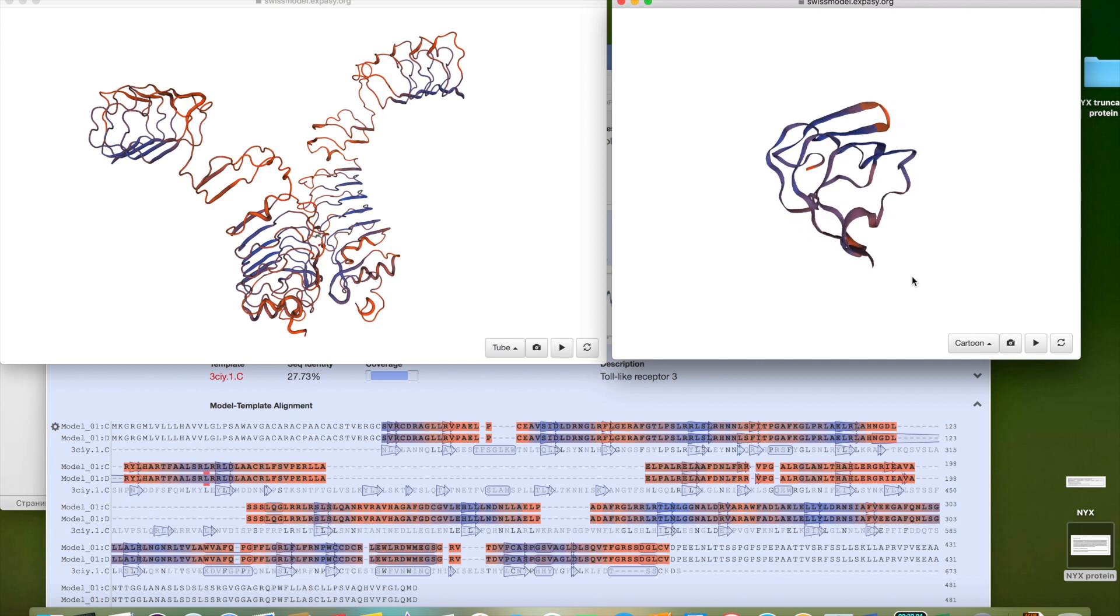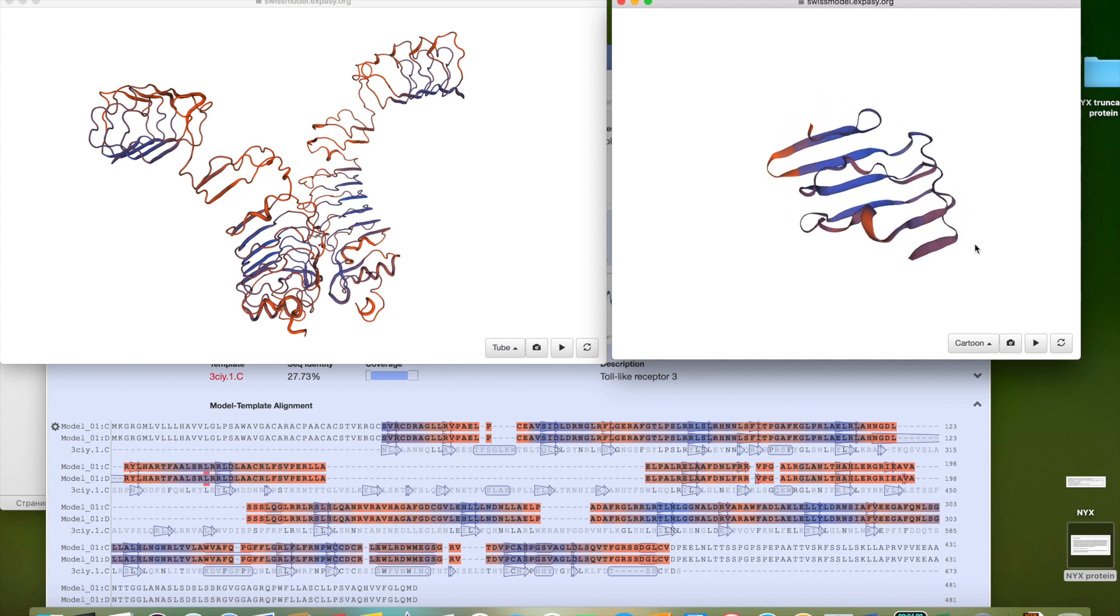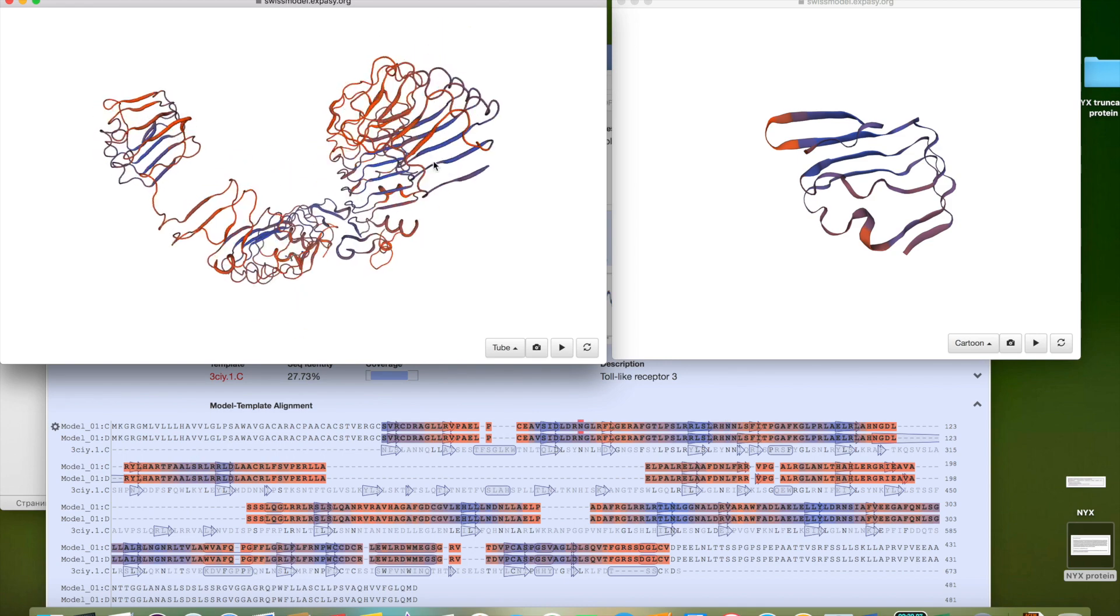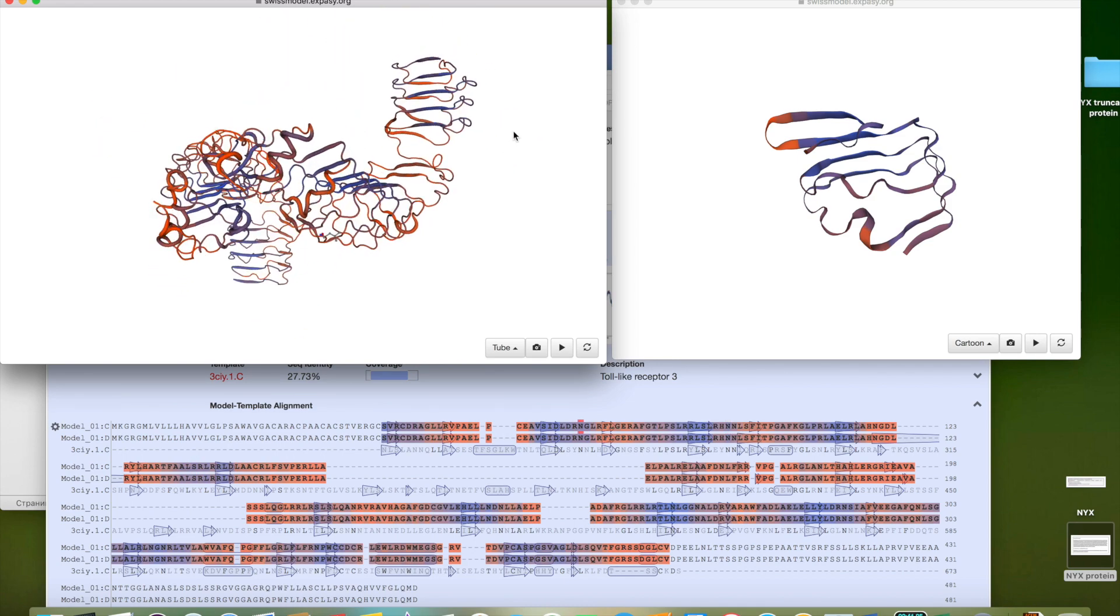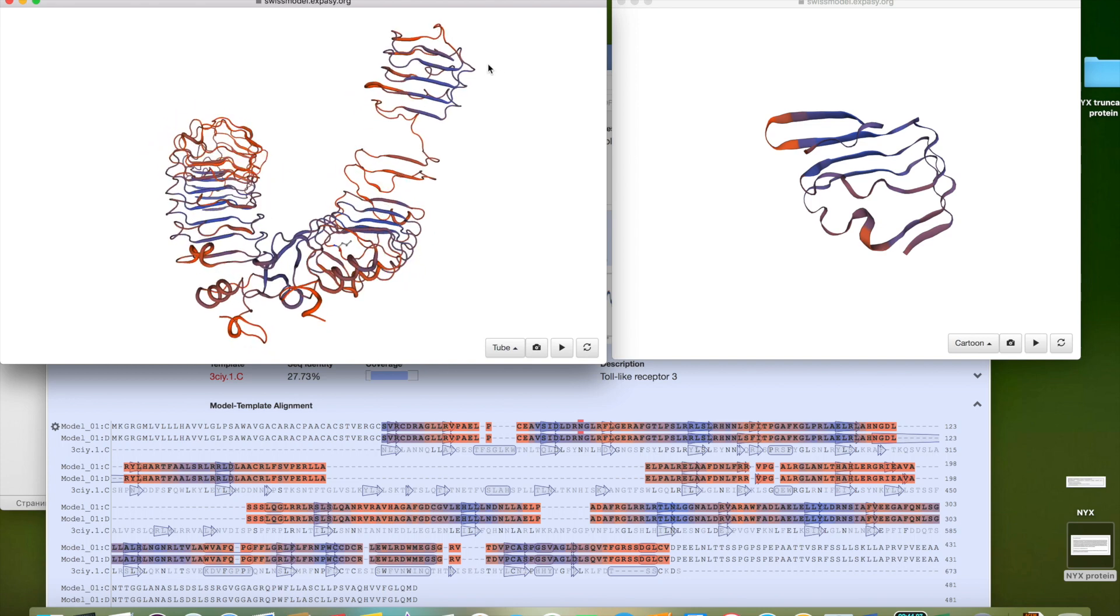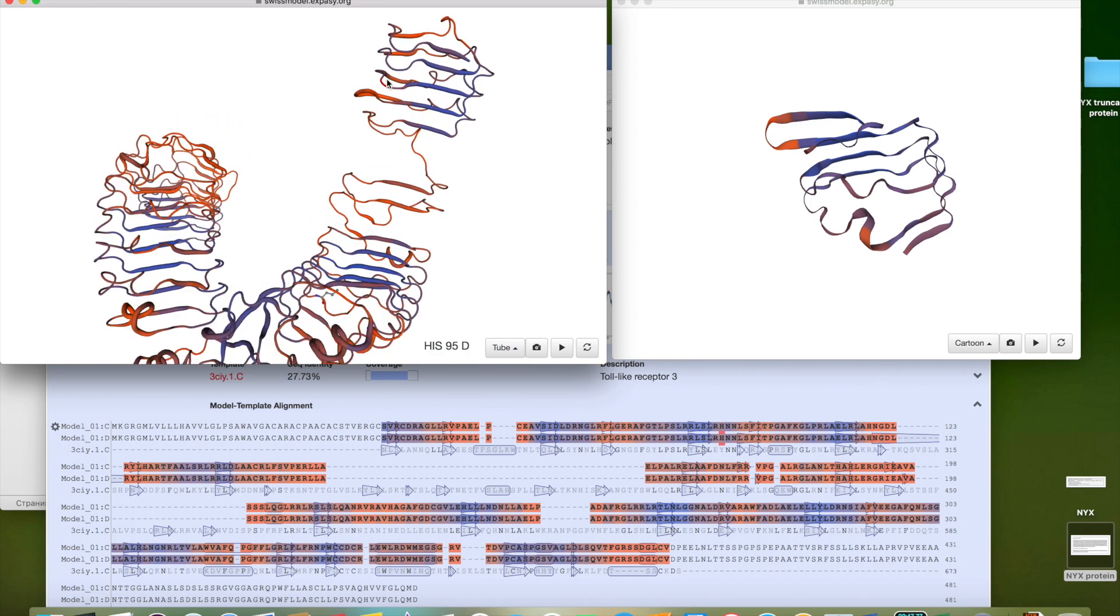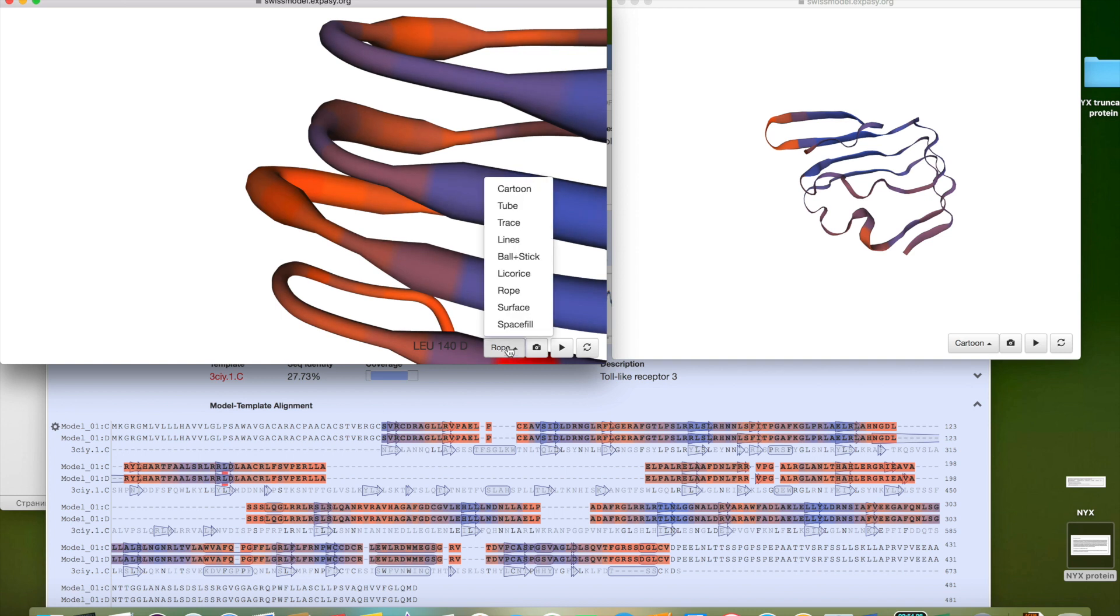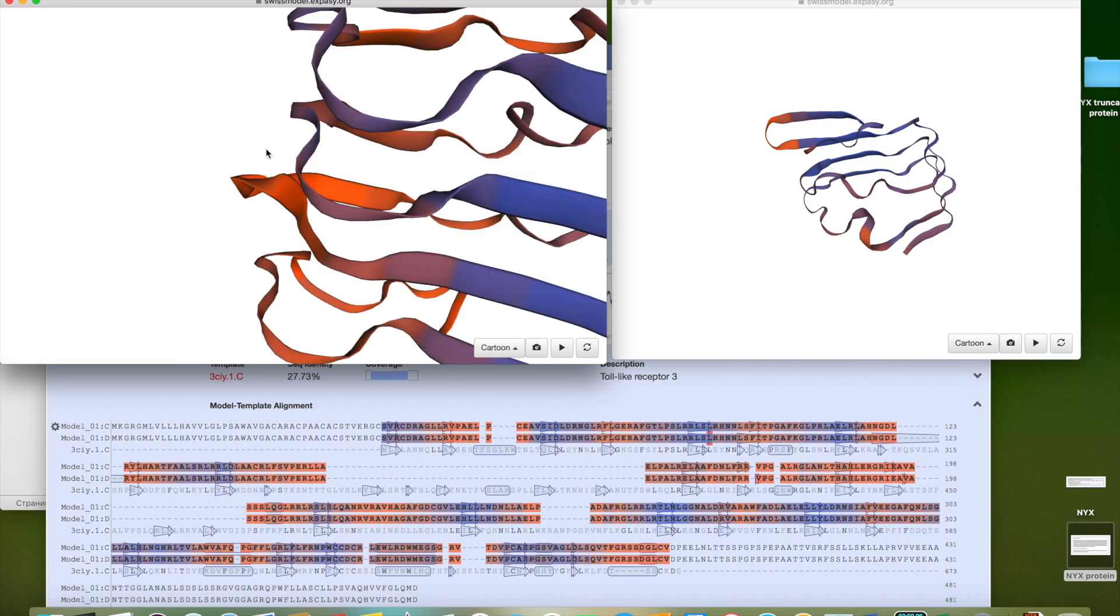Of this protein. Okay, yes. This one, this one. And we can see it in cartoon, and like this, and like this.